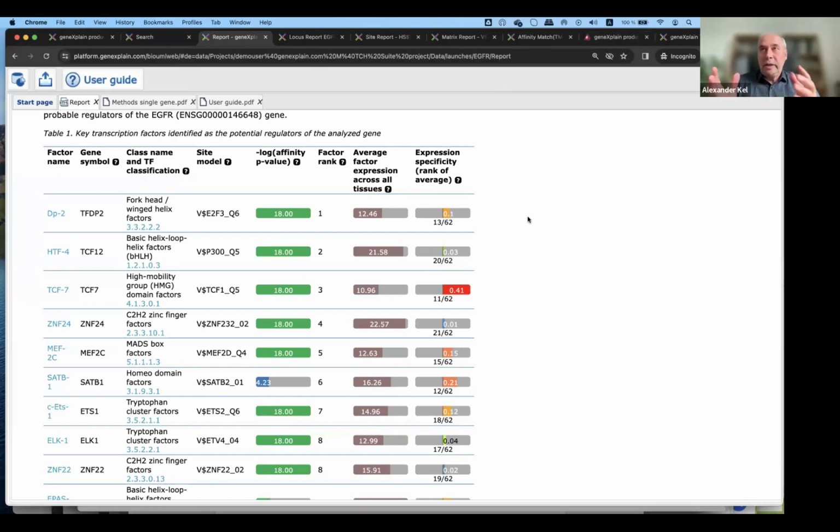That clearly shows you this paralogous extension, where the motif built from the factor binding sites of TCF1 can be extended towards predicting binding sites for the paralogs, like also TCF7 and other paralogous factors which have a very similar DNA binding domain. So that's how the paralogous extension works.